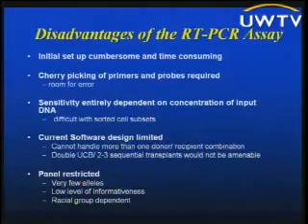So in terms of disadvantages, there's a huge number of disadvantages to this system. One is that the initial setup is extremely cumbersome and time-consuming compared to the STRs, which is a single tube PCR reaction, and off you go. There's cherry picking of primers and probes required because they don't sell them as a kit, or they sell them as individual tubes, and you have to actually pick what it is that you're going to interrogate and maintain a profile on each donor-recipient combination and go back to different tubes constantly.